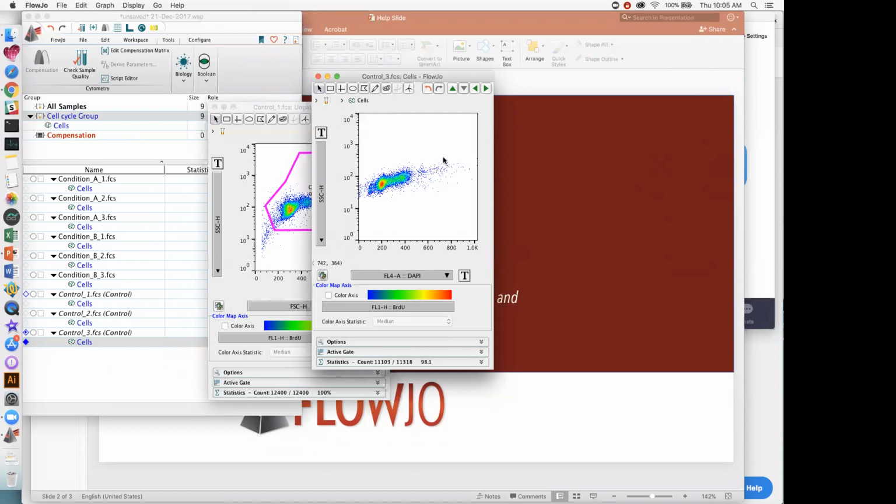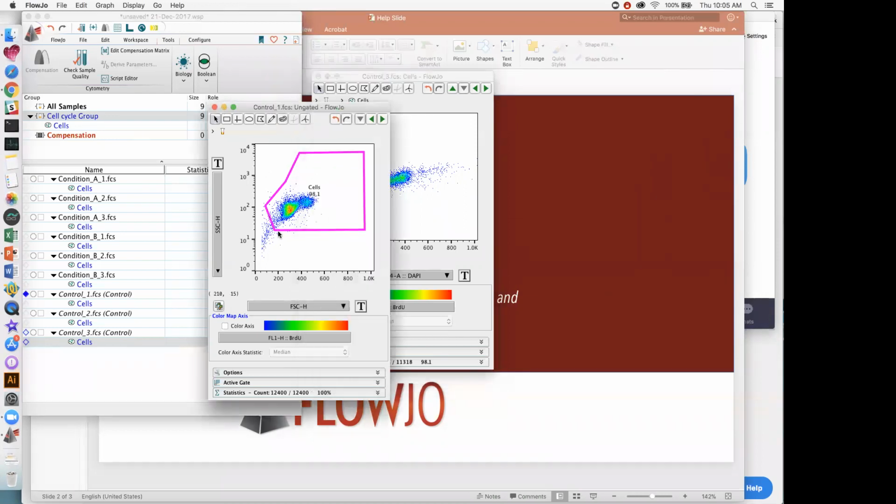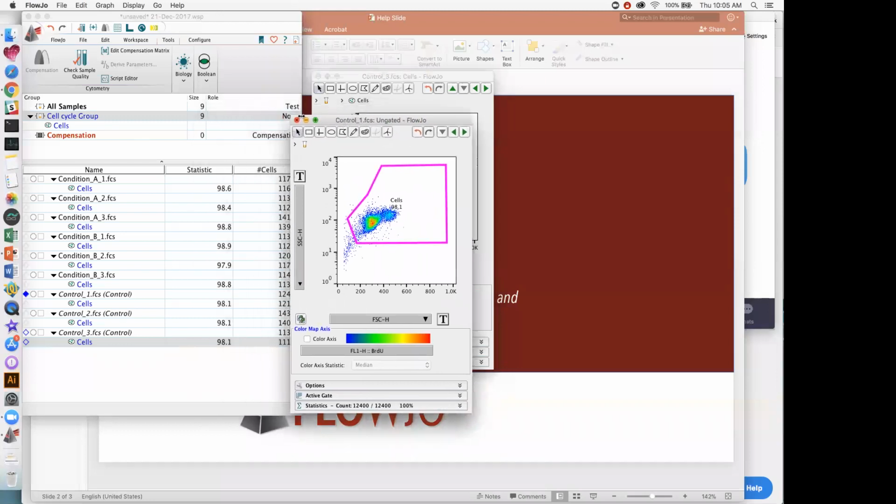You can quantify how many of those there are, and so if I were you, a lot of times I like to leave the cells kind of untouched here, and I don't go ahead and gate them with a euploid gate. I leave them alone. So since we have only these dimensions here, I was only really able to clean up the cells by getting rid of some of the debris at the bottom, and other than that, we have to go with the vast mix of cells that we have in this particular data set.